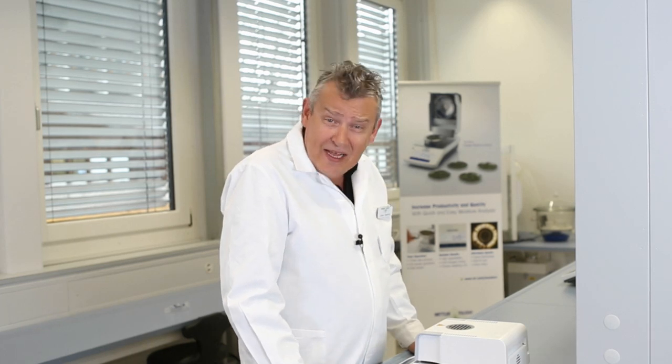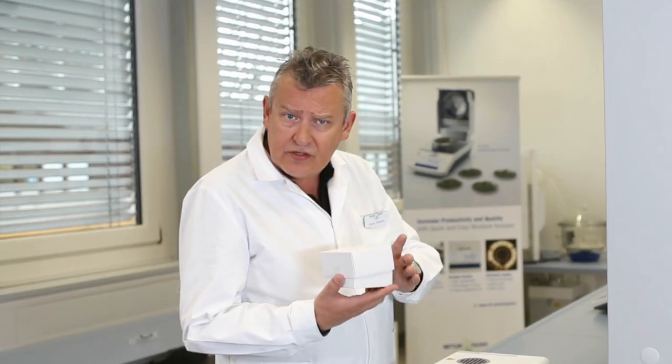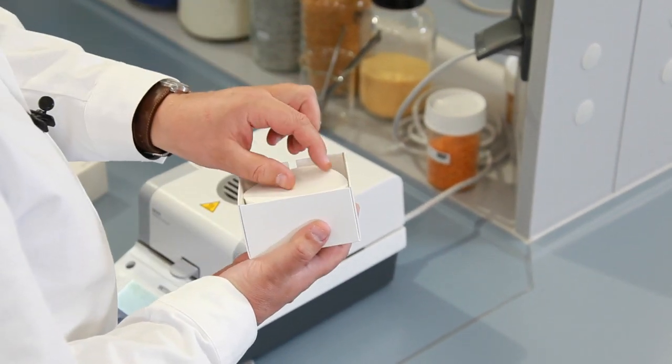For measuring liquids or pasty substances, we recommend using these glass fibre filter papers. A filter paper ensures fast and homogenous spreading of the sample, which therefore reduces measurement time by up to 50% and can increase the repeatability of your measurement.